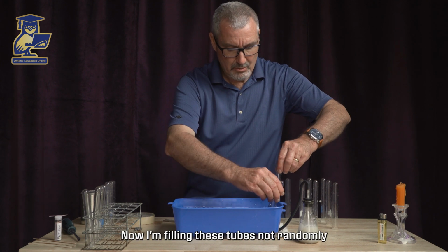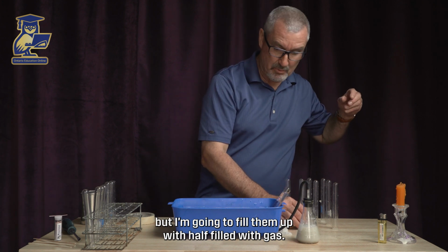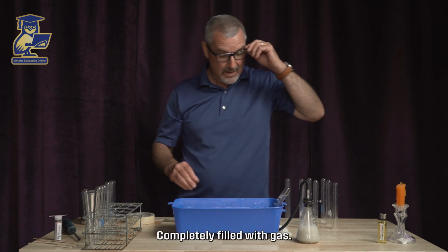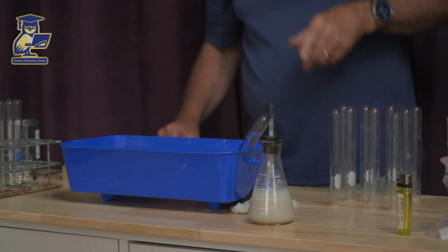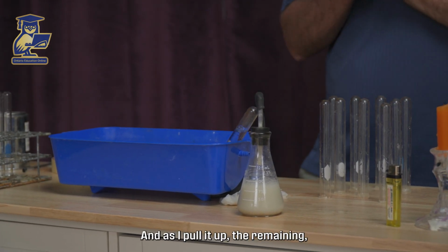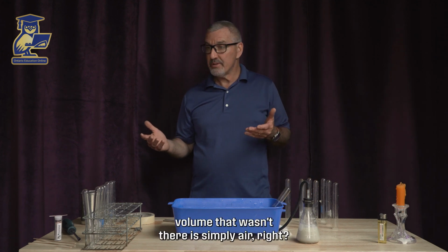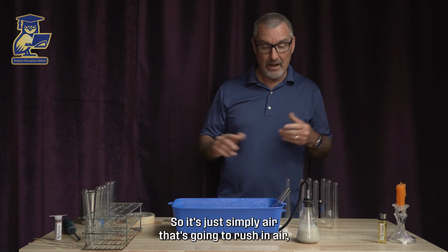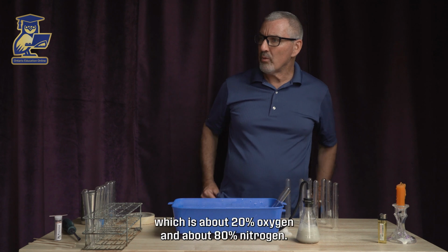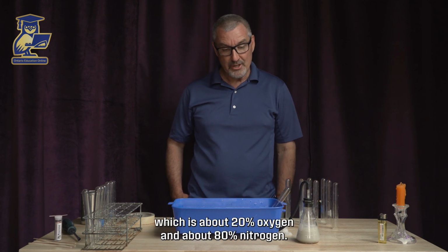Now I'm filling these tubes not randomly, but I'm going to fill them half filled with gas, completely filled with gas, quarter filled with gas, and a tenth filled with gas. As I pull it up, the remaining volume that wasn't there is simply air that's going to rush in. Air is about 20% oxygen and about 80% nitrogen.